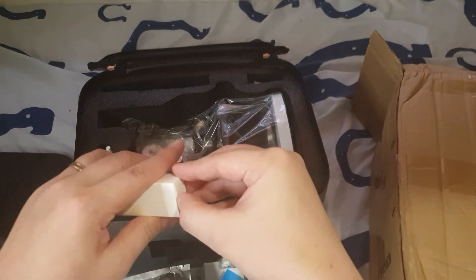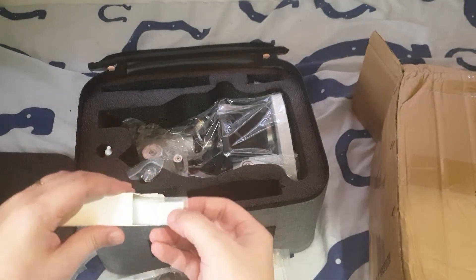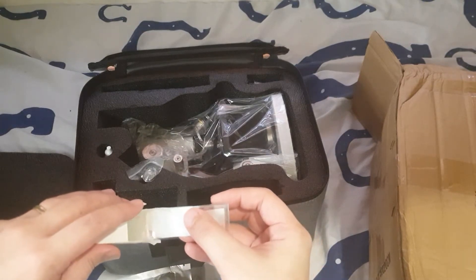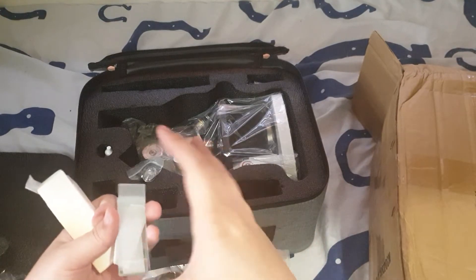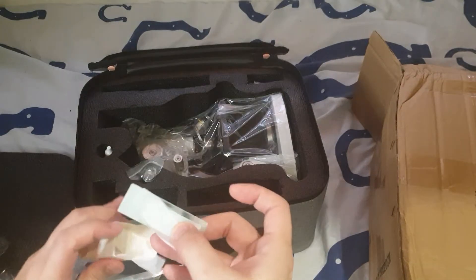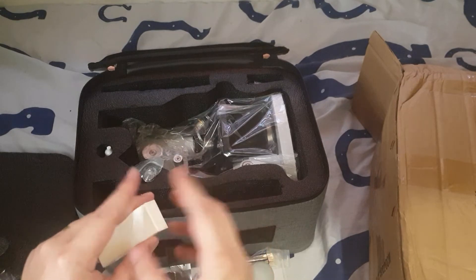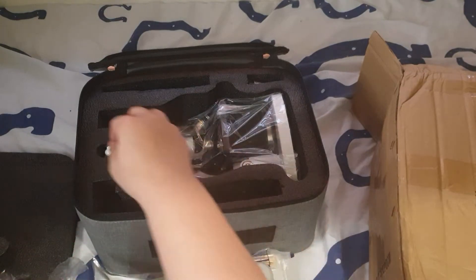I wonder what this is — you've got slides there. I thought these might be samples, but no, they're also slides. So, glass slides — looks like I contaminated those by handling them. I'll put that back later.